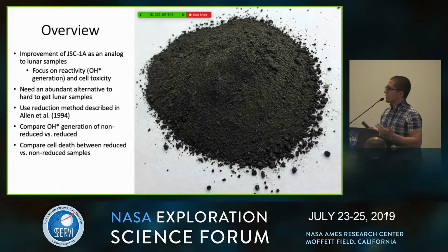So basically what I'm doing is I'm taking JSC1A, which is a lunar regolith simulant, and I'm trying to improve it in order to be able to do reactivity and cell toxicity studies in order to be able to see how these samples might affect people. And we need a lot of it in order to do multiple studies.